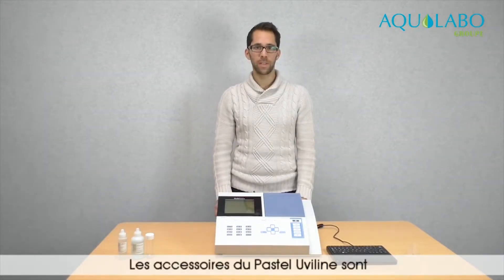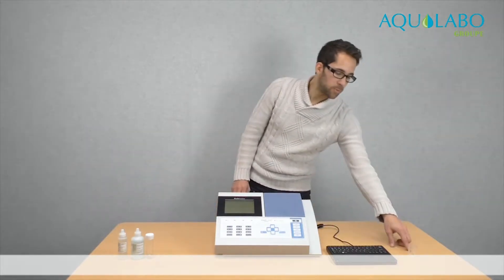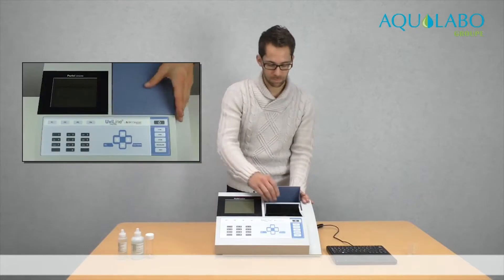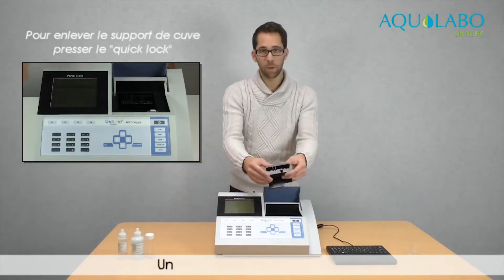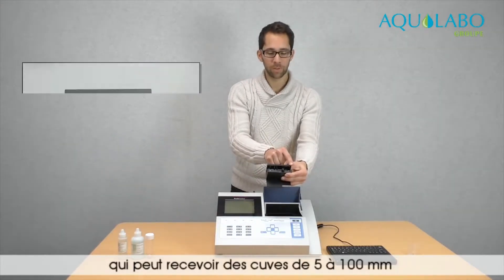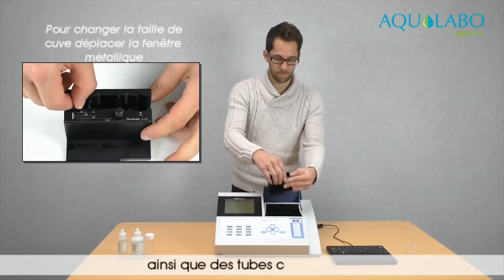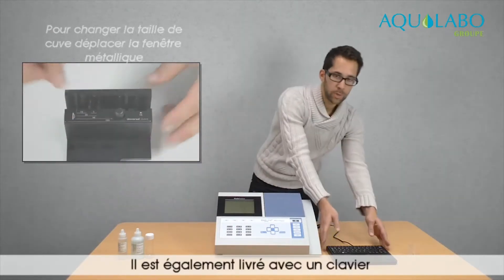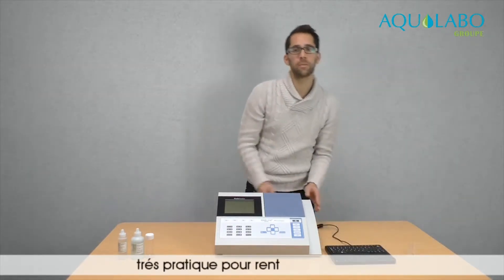The accessories of the Pastel UviLine are a 5 and a 10 millimeter quartz cell, a universal cell holder that can receive cells from 5 to 100 millimeters and also round tubes. It also comes with a keyboard that is very handy for text input.